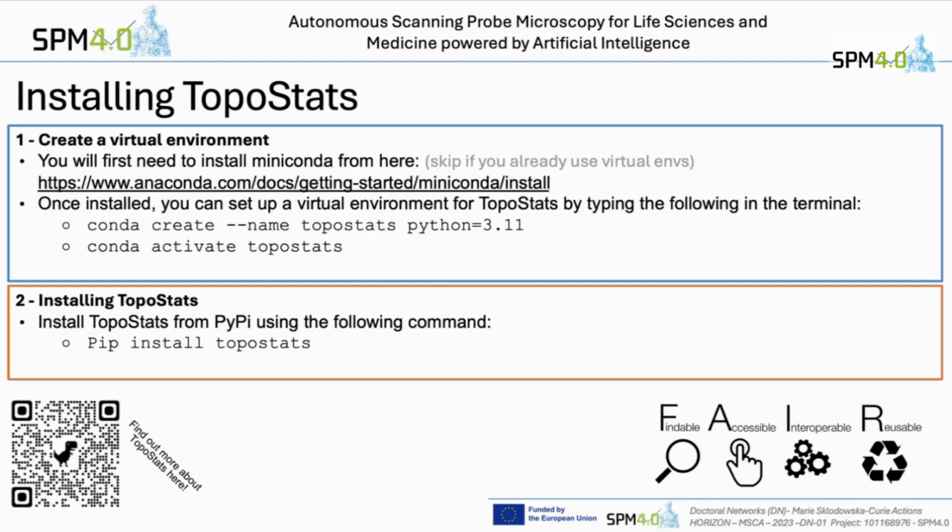So I think the easy thing to do is just for us to start using it. This is where it usually goes wrong for most people, so it might take us the most time. Has anyone, just as a question, used virtual environments on their computer before? Yes, a few. Okay. So have you got Anaconda or Miniconda installed? No. Okay. Yes, some people have. Right, okay. So that's the first thing to do. Everyone can do this, Mac or Windows, install Miniconda. That's the first thing to do. And then let me know when everyone's installed Miniconda, and we can move on from there.